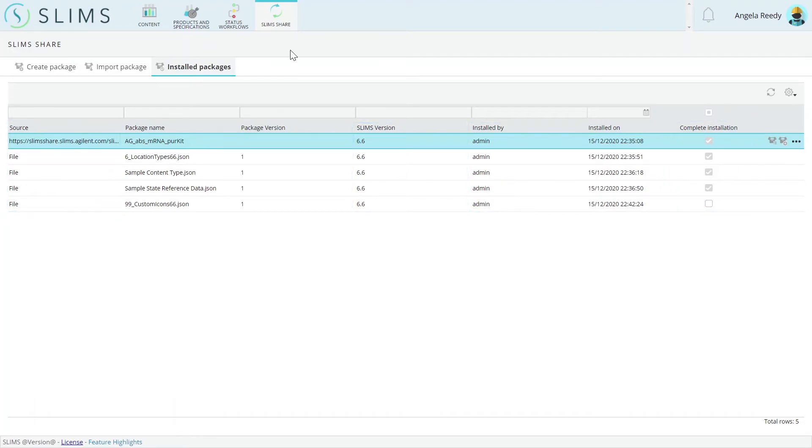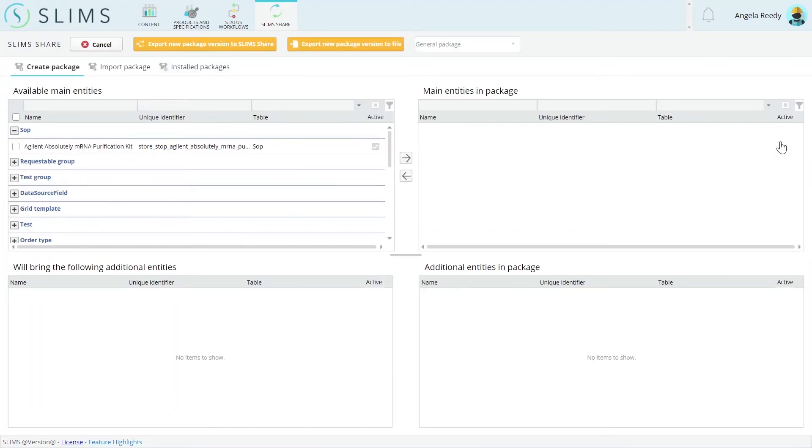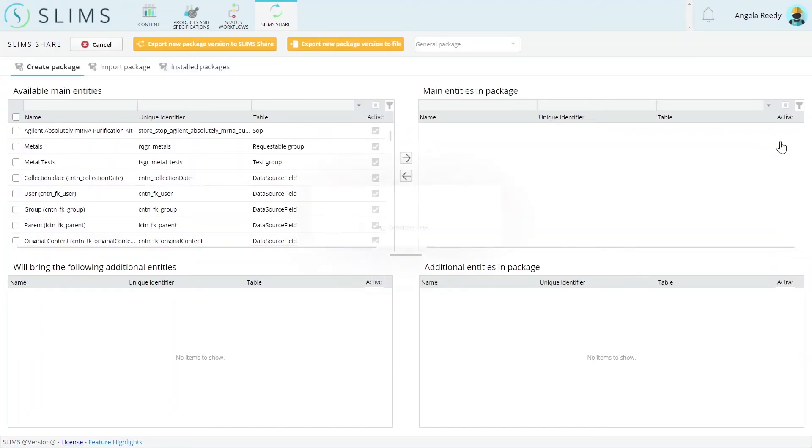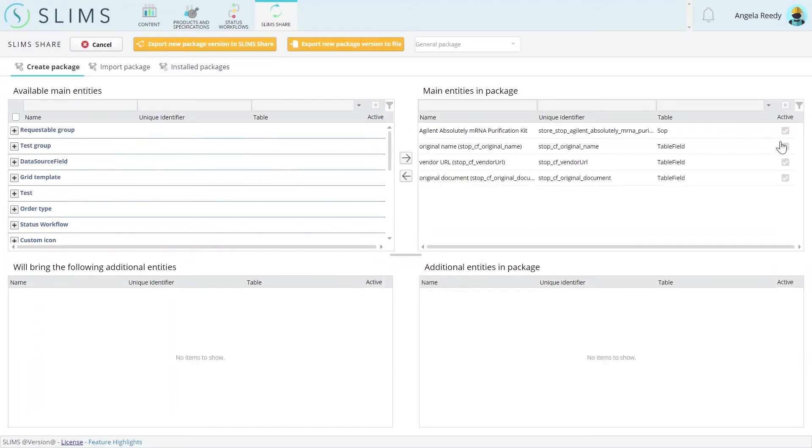If an installed package has become outdated, the Version button opens the Create Package tab with the New Version ribbon, so that Slims engineers or super-users can create a new version of the package on the spot.